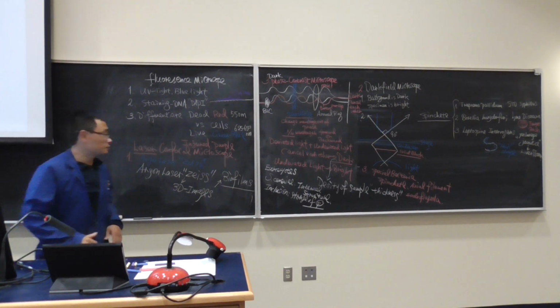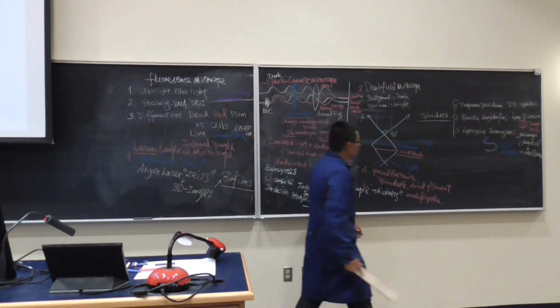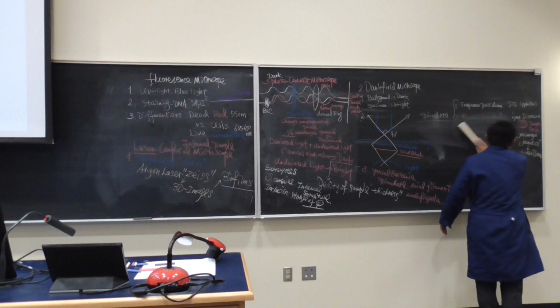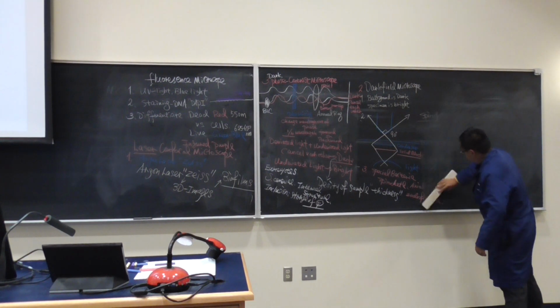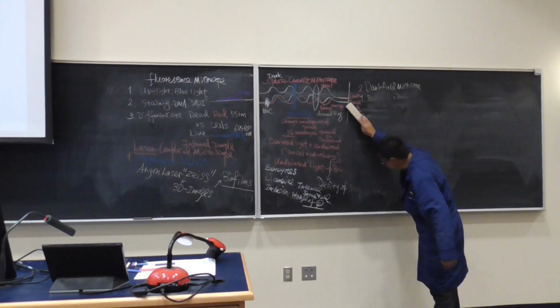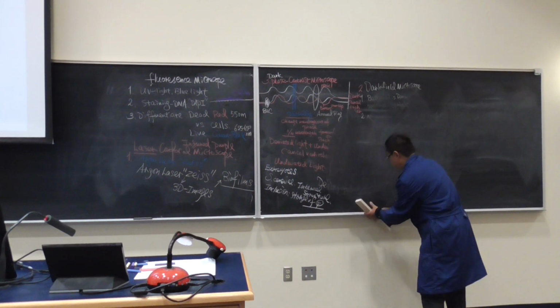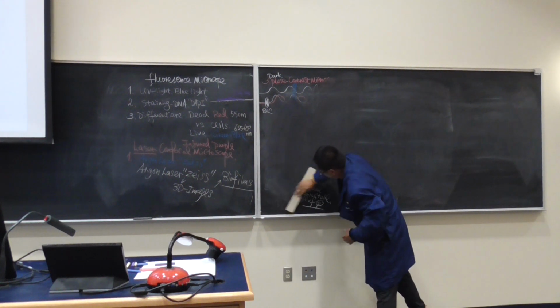Okay, very quick, we're going to move on to the staining technology. So we finished introducing all of these, and we're going to spend time talking about staining technology. We will spend a big chunk of time talking about the gram stain before you practice in the lab next week.